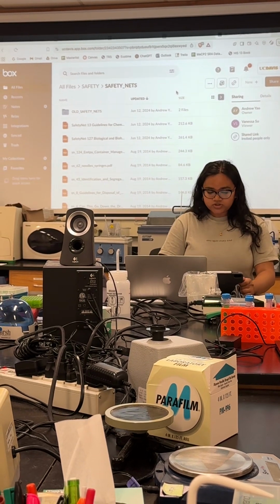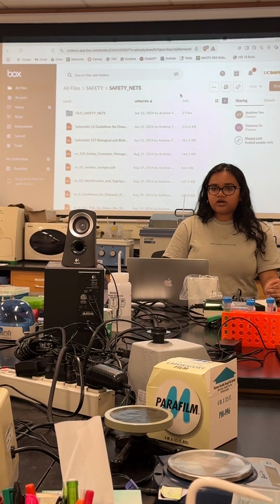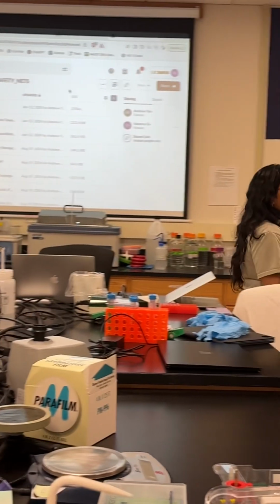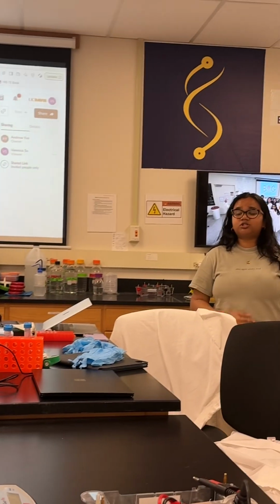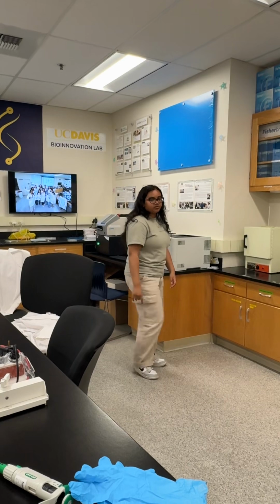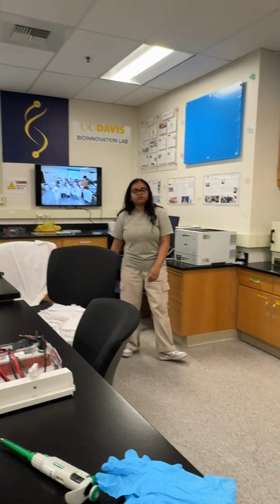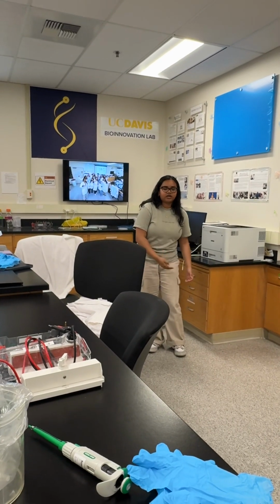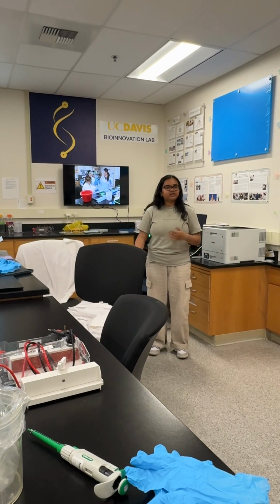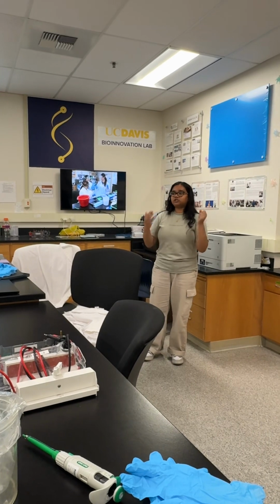Awesome. Okay, so we're about to do our in-person walkthrough, but before we do that, I'm going to mention a really important point. Part of the PPE and lab safety actually starts before you guys come into lab, and the first bit of that is wearing long pants and closed-toed shoes. So what I'm wearing today does exemplify that. I'm wearing shoes that completely cover my toes, and even when I sit down or raise my leg, you can't see my ankles. Some labs won't even let you in if you don't have long socks that cover your ankles. Here in Big RT, we're trying to practice good practices about how to get into labs and have good lab safety. So that starts now and here.